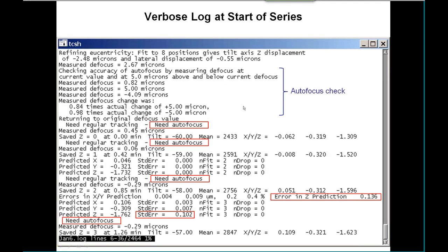Here's an example of what the log looks like as we start a tilt series. This is the result of the checking of autofocus, where it changed the focus by five microns up and down and measures the defocus. It tells us that what it could measure was 84 and 98 percent of the actual focus change, which is fine for doing our focusing.